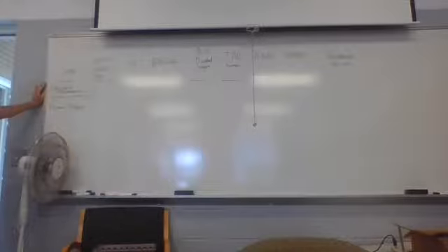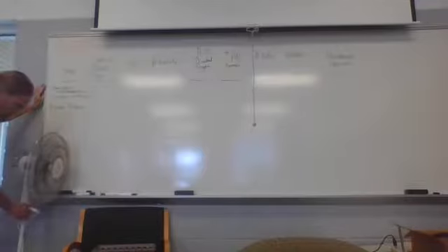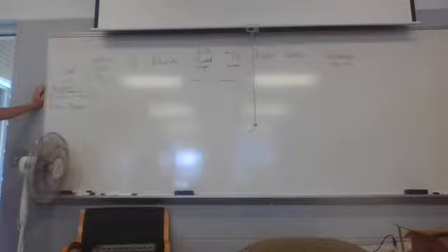So we usually talk about salinity, right? But I lump those together: conductivity, salinity, and TDS. What's TDS? All right, good job. All right, give me some ways to measure those. Well, I'm looking at this kit right here. Which one? This little blue kit right here to your left. Right, this one? Maybe, yeah.